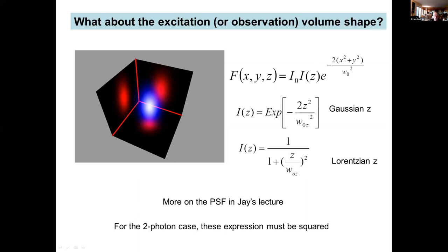And so it's very important also the distinction we have between one photon excitation, in which the Z is also a Gaussian. And this is the waist of the beam, not the width of the Gaussian, but the optical waist of the beam, and so on. In two photon excitation, the beam decreases in Z as a function of the square of the intensity, so that has the form of 1 divided by a polynomial of a Lorentzian.